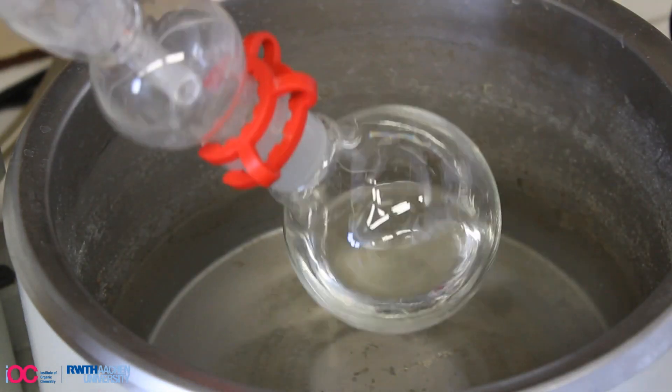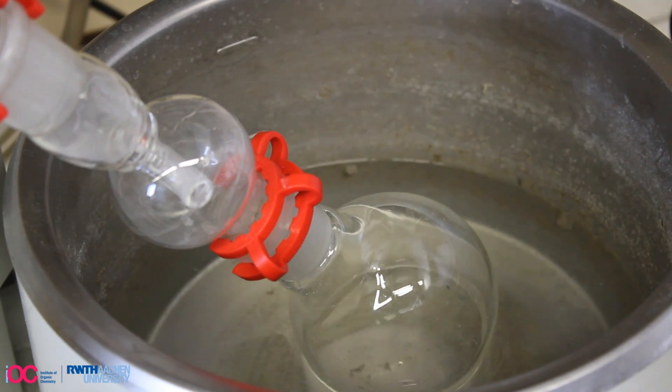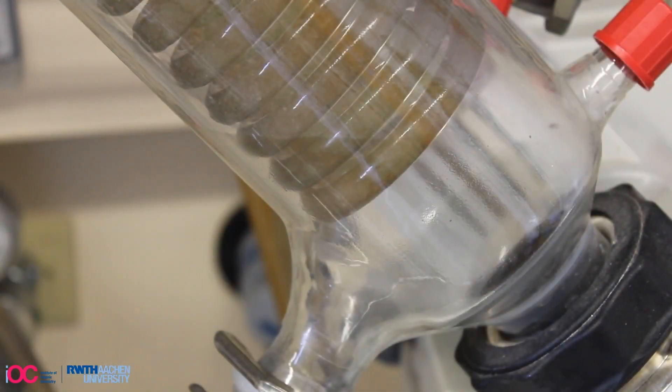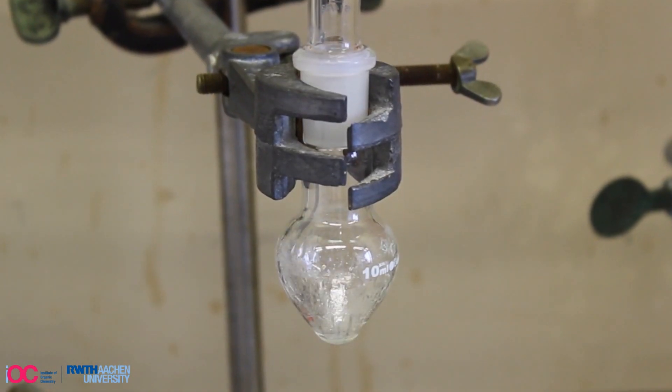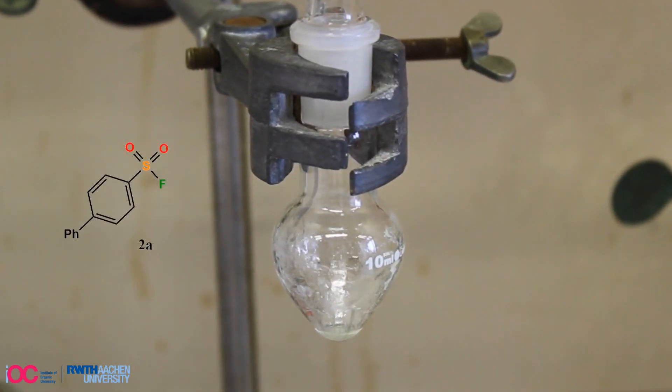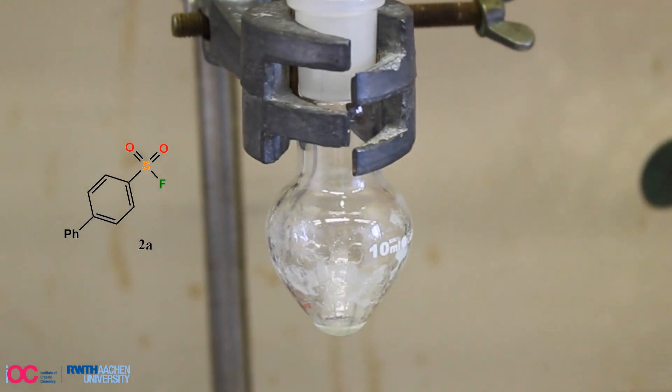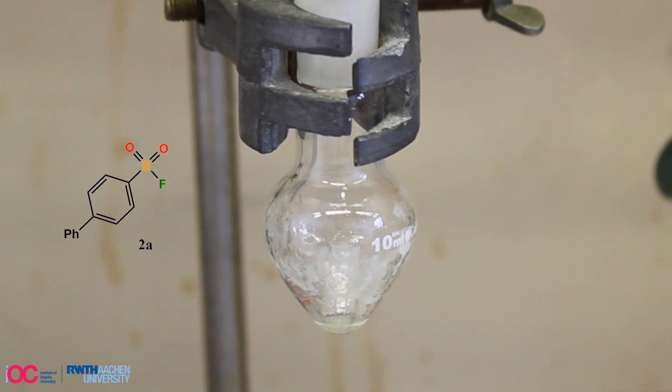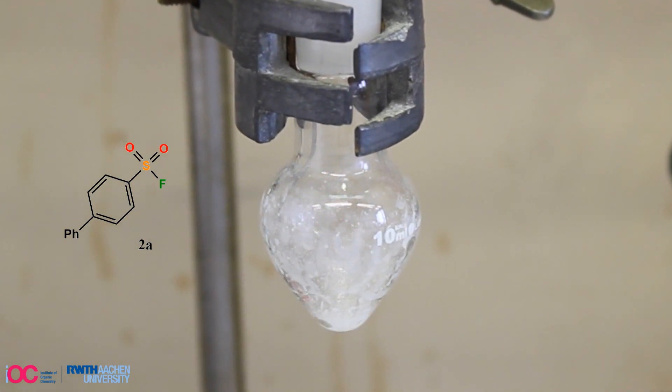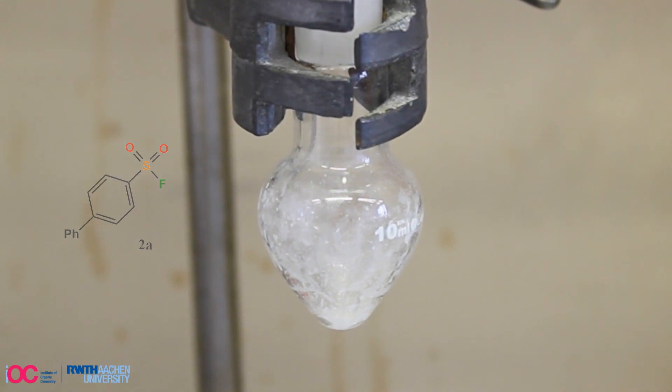Finally, the solvent is removed at reduced pressure, either at 40 or 20 degrees Celsius water bath temperature, depending on the volatility of the corresponding product. Then the product can be transferred into a smaller reaction vial and dried on high vacuum if the volatility allows. In our case, sulfonyl fluoride 2A is obtained as a colorless solid in high yield with a purity above 98%.